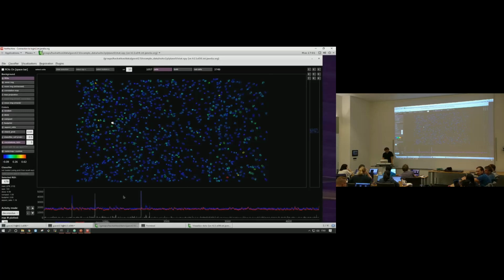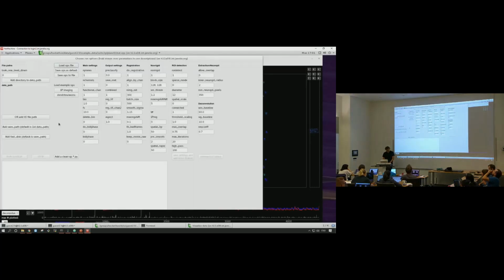Okay, one more thing I wanted to go through before we end this. I don't think we went through all the parameters. So you guys wanted to know what every parameter does? Yes. Okay, probably even better. So the first thing I can tell you is if you mouse over it, you'll get a little description of what the parameter is. So in general, 0 is inactivated and 1 is yes. Yeah, for Boolean variables, that's the true form.